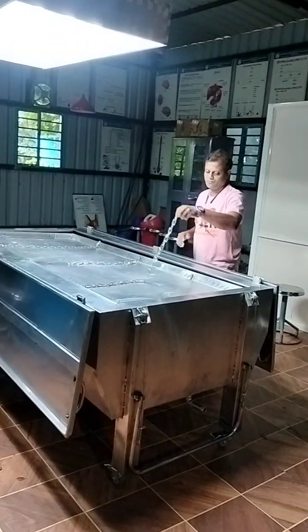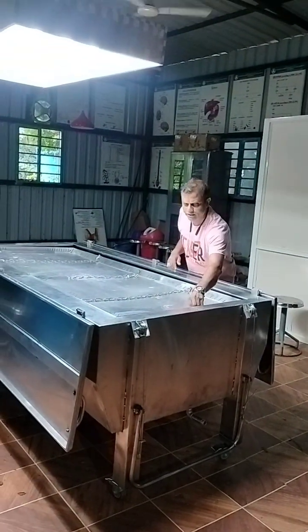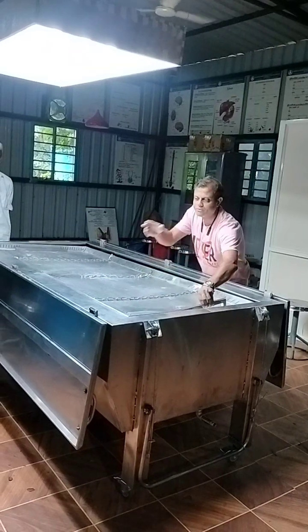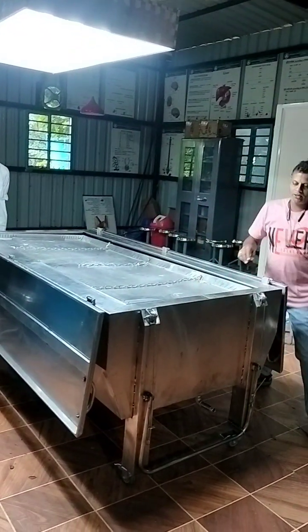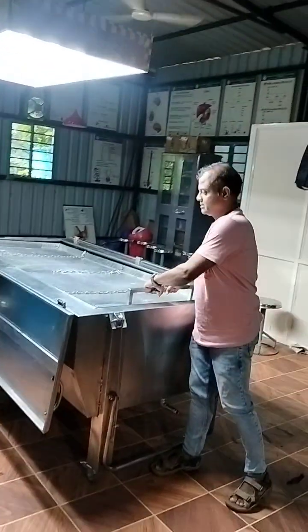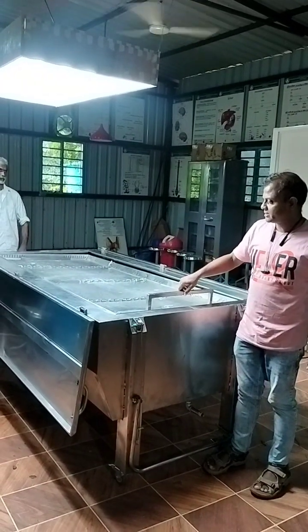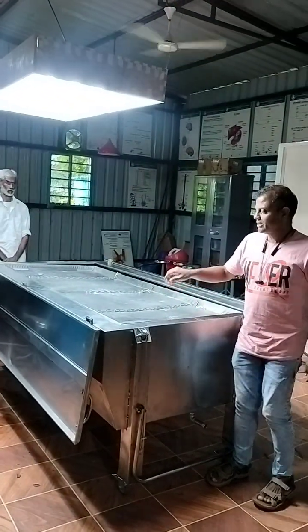We have a chain system here. Then we have a handle here which works as a stretcher as well, if you want to take out the body. This is the handle, and these are collapsible handles as you can see here. They collapse inside so they don't obstruct during dissection.